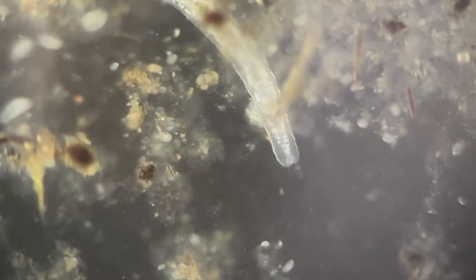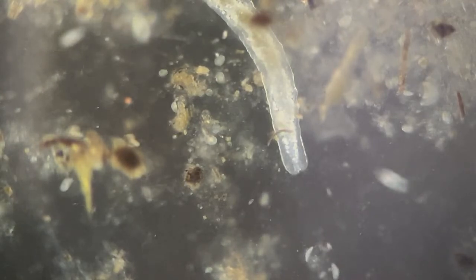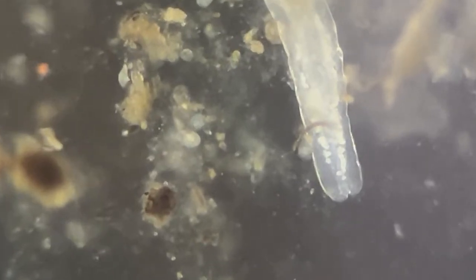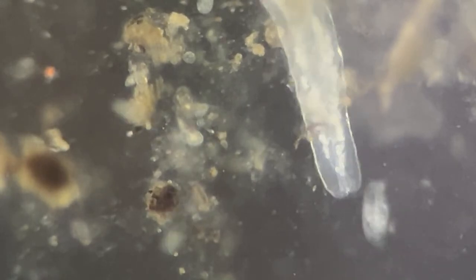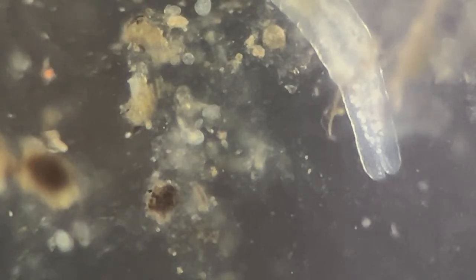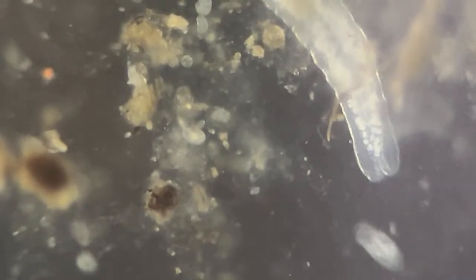Okay, let me show you the eggs in this creature. Probably you can make out the outlines of this little worm, and you can see the peristaltic movement within the body. Okay, let's go for a higher magnification here to see something more.